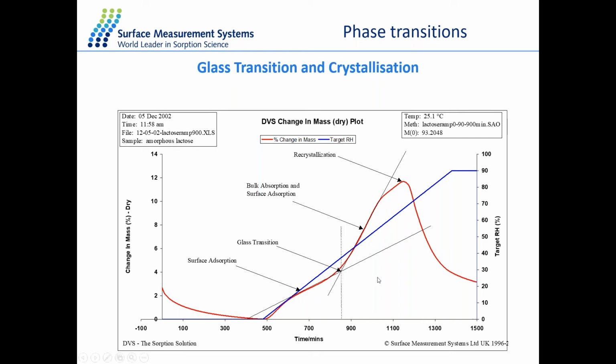So I have my humidity going up, and I will have my mass constantly growing as a parallel line. Very, very simple. Any deviation from the parallel line indicates that the sample is changing in structure and the mass uptake is responding to the change in structure of the sample. And that's what we are highlighting over here.